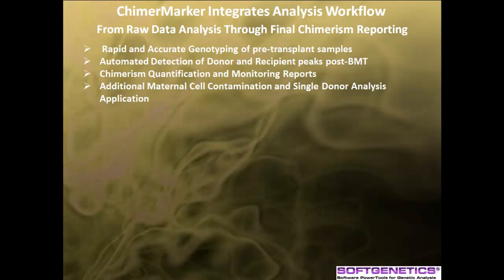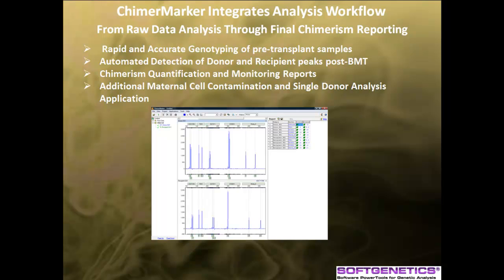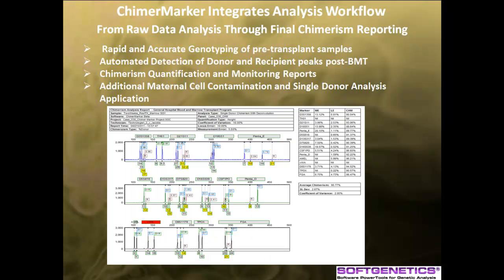ChimerMarker software integrates analysis workflow from raw data analysis to chimerism quantification and reporting. The software is compatible with all major CE instruments and human identity chemistries for rapid, accurate size and allele calls. It has a user-friendly interface and link navigation that decreases error due to data transfer, automates peak identification, and contains an audit trail when user management is activated. For chimerism analysis of post and pre-transplant samples, the software automatically detects donor and recipient peaks, and uses this information to quantify percent chimerism by height or area. The results can be displayed in percent donor or recipient in the comprehensive summary report. Additional applications include maternal cell contamination and single donor chimerism analysis. Please see a separate webinar for more information on these applications.